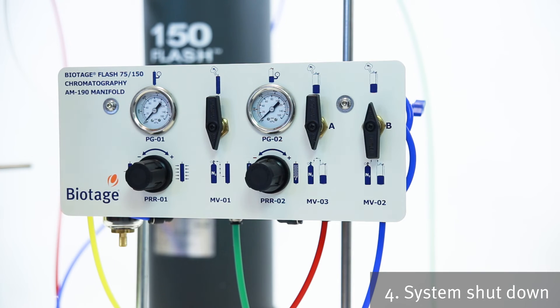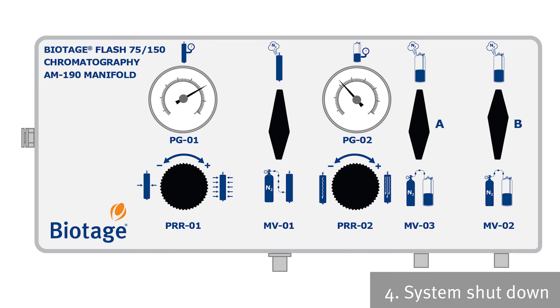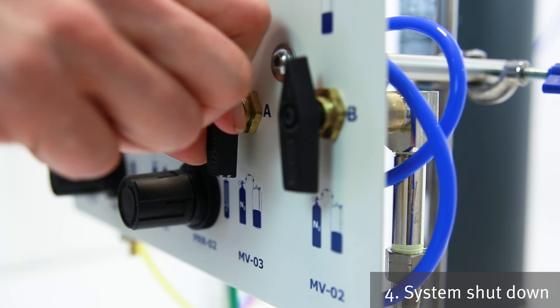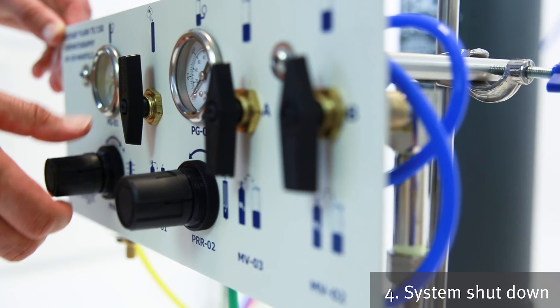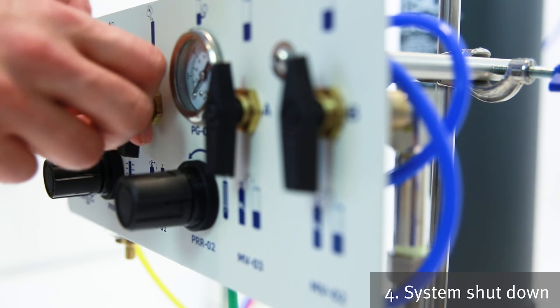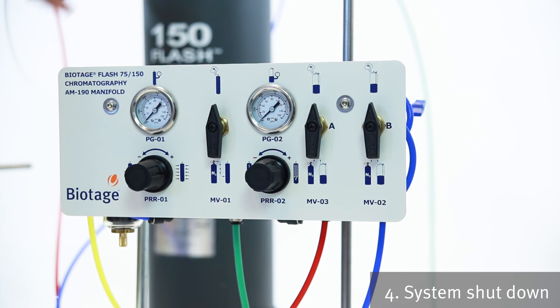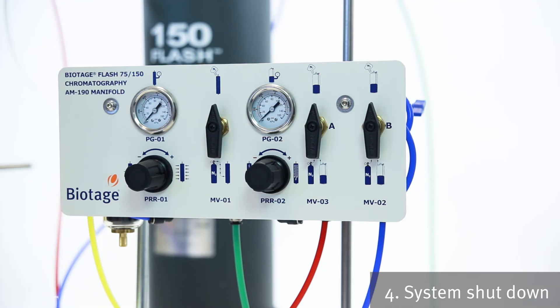Okay, so once you've finished your run, in order to depressurize the system, it's just simply a reverse of what we did in the first place. So we're going to turn down the pressure gauge here on PRR2 and wait for the pressure to drop down. Once that's dropped down, we can turn the 60 liter solvent reservoir to the vent position. Then we're going to depressurize the radial compression module. So we're going to turn this down, wait for that to drop below 20 psi. And then we're going to turn that to the vent position. And just watch for the red dot, the pressure indicator on the radial compression module, to pop back in. And then we know it's safe to take the system apart.